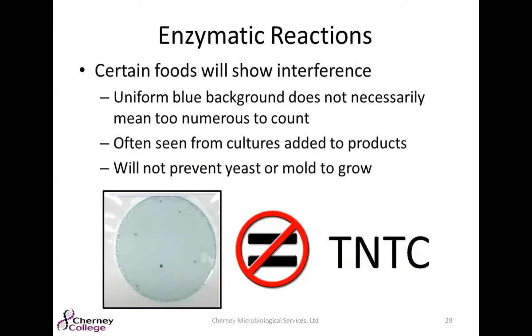So carrying on these enzymatic reactions, certain foods are going to show interference, some will not. That blue uniform background doesn't necessarily mean it's TNTC. Often you're going to see this from cultures that are added to certain products. And also you should know that indicator reaction is not going to prevent yeast or mold to grow. So with that picture there, you can see the yeast colonies present.